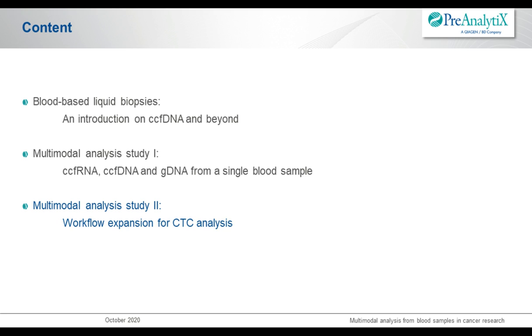Okay, so coming back to the overview, now in the final part of my talk, I would like to show you the second study for multimodality. In this study, we expanded this multimodal workflow further to the analysis of CTCs.